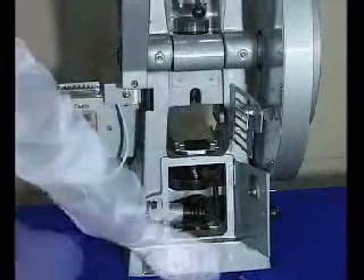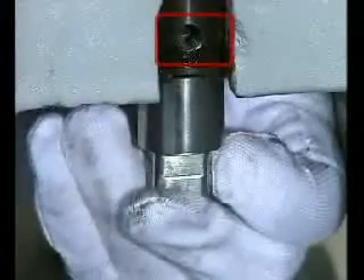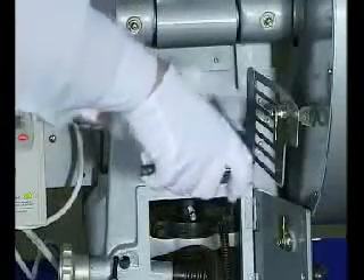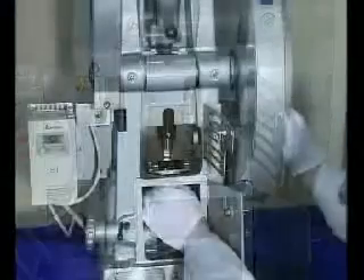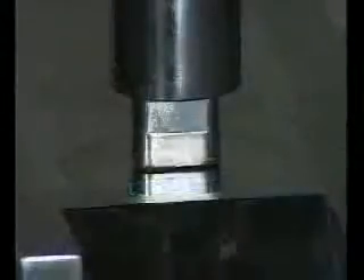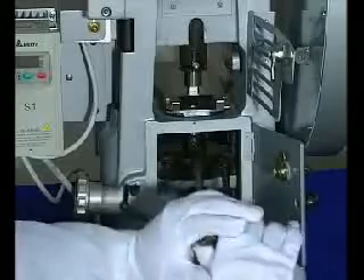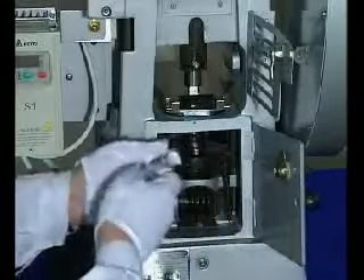Insert the upper punch into the end of the hill of the upper punch guide rod. Make the inclined plane of the upper punch aim at the fixing screw of the upper punch, then tighten the screw. Turn the hand wheel to drop the upper punch slowly. Turn the lower punch and die to adjust the position so the upper punch can enter the die board. Turn the fixing screw between the die plate and upper punch, and turn the hand wheel to check several times.